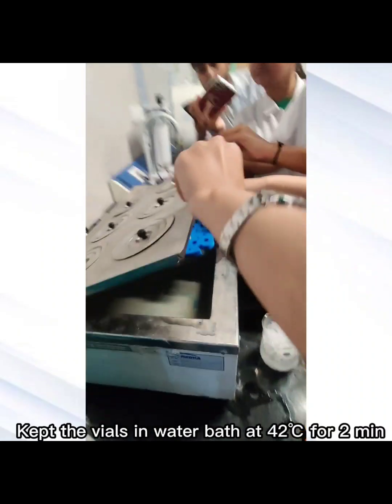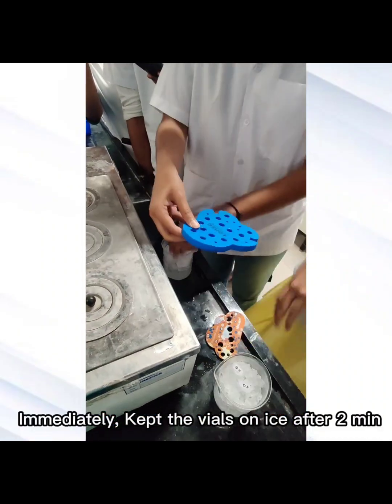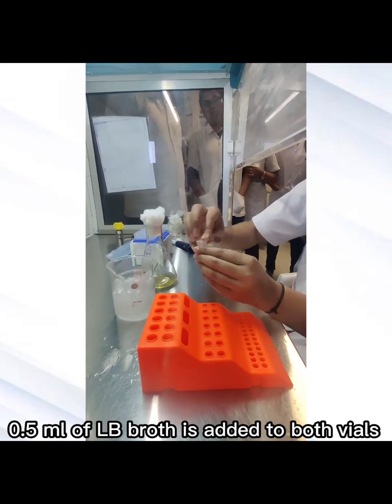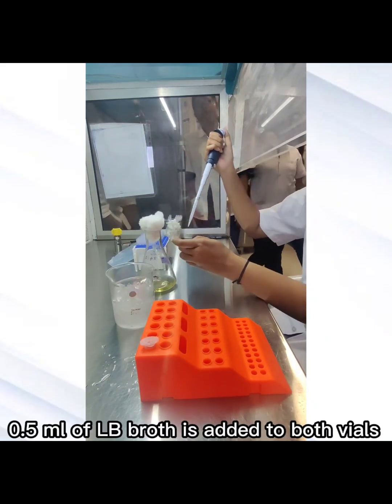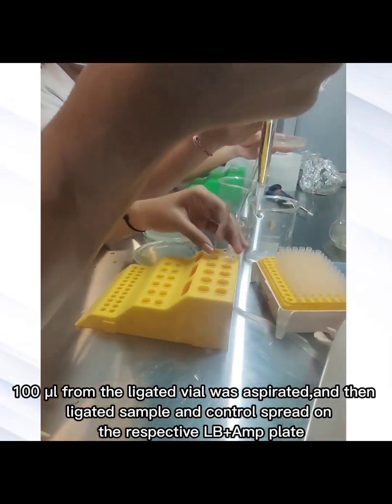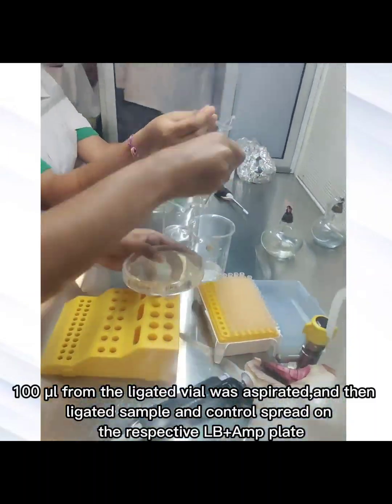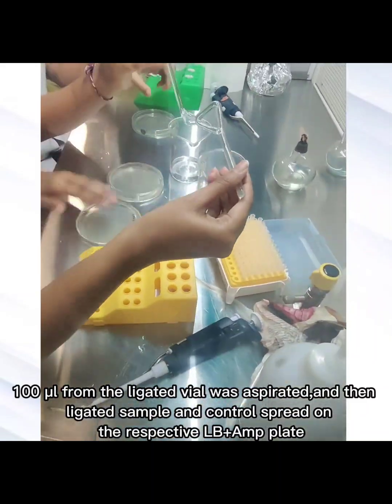Keep the vials in a water bath at 42 degrees Celsius for 2 minutes. Immediately keep the vials on ice after 2 minutes. Add 0.5 ml of LB broth to both tubes. Keep the vials in a shaking incubator for an hour. Take 100 microliters of ligated sample and spread it on an LB plus ampicillin plate. Subsequently, take 100 microliters of control sample and spread it on an LB plus ampicillin plate.